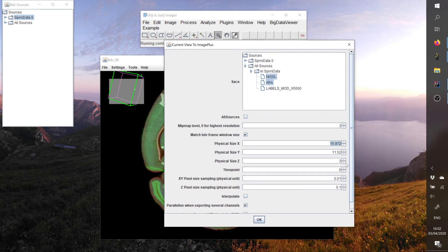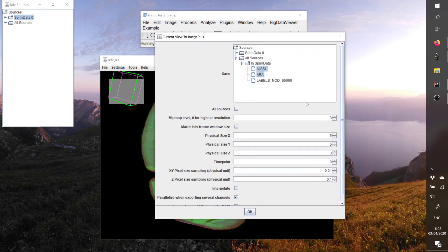to do something smaller. I want exactly like five millimeter. Okay, I need to uncheck this. I want exactly five millimeter by five millimeter centered on this window.